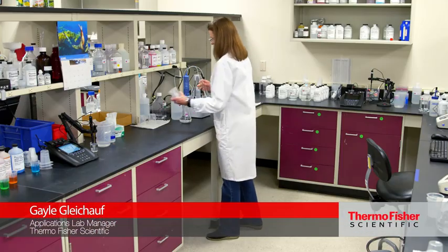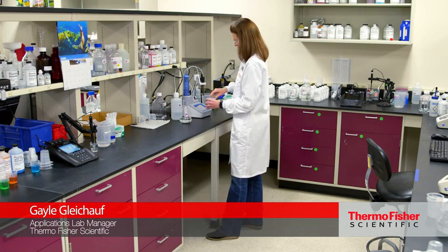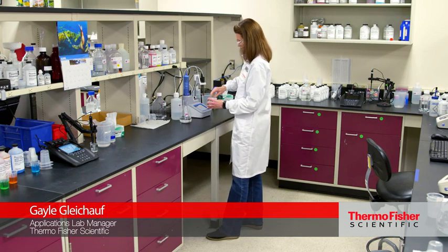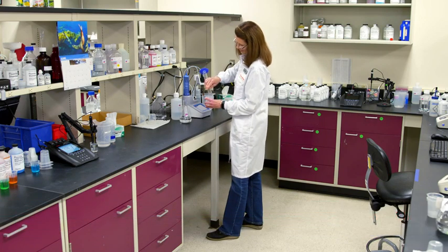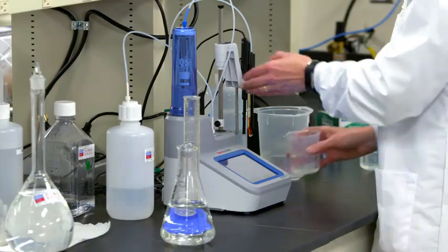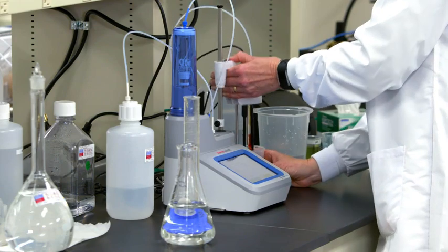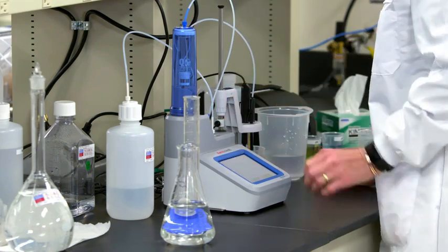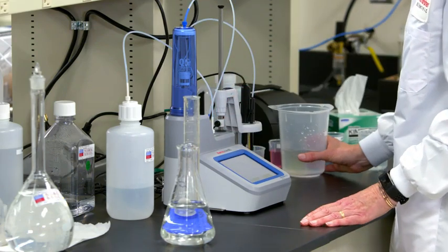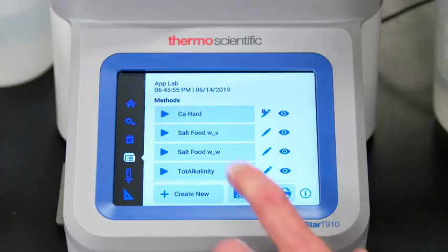Hi, I'm Gail, the Applications Lab Manager at Thermo Fisher Scientific Water Analysis Instruments. I'm here to show you how easy it is to use the Orion Star T910 pH automated titrator.